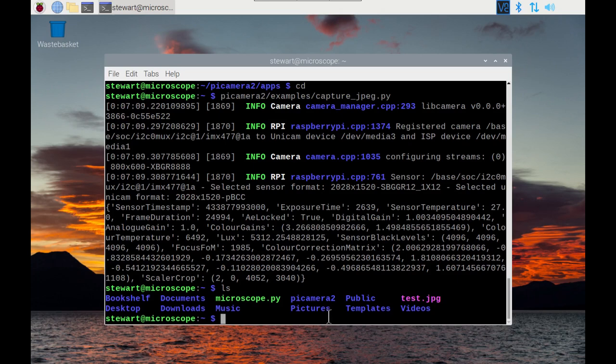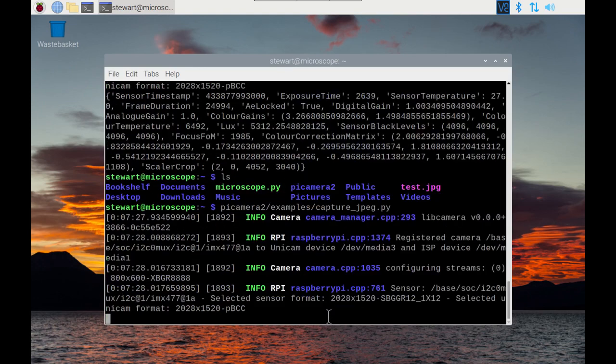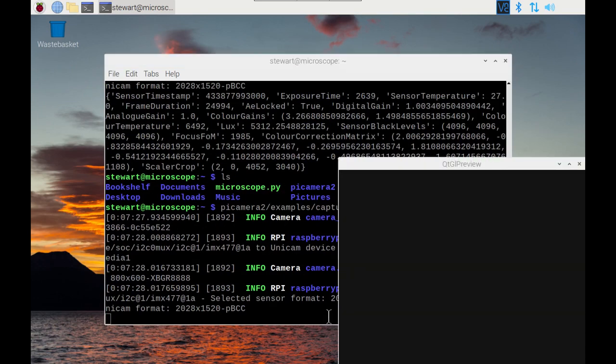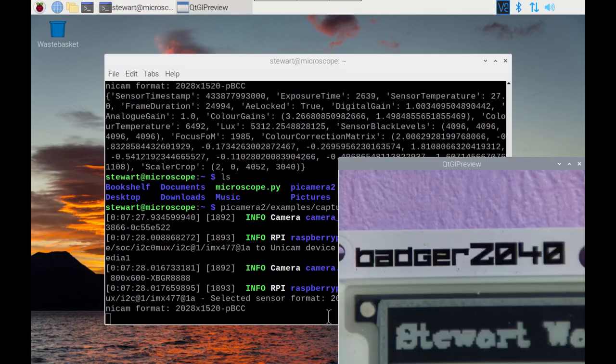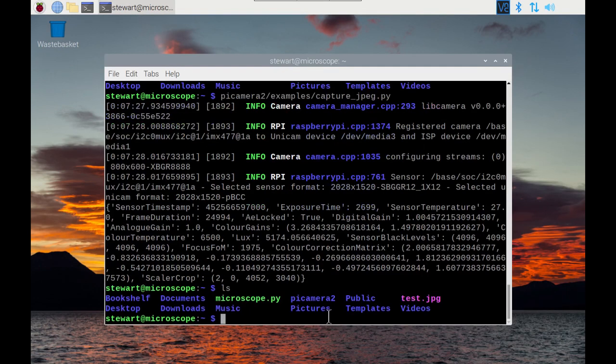The problem with this is that if you run that again, then it's just going to override that test.jpg file. As you can see it's not created another file, it's just overwritten that. So what you could do is rename that before you run the capture again.